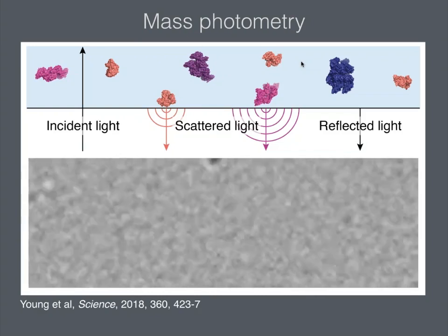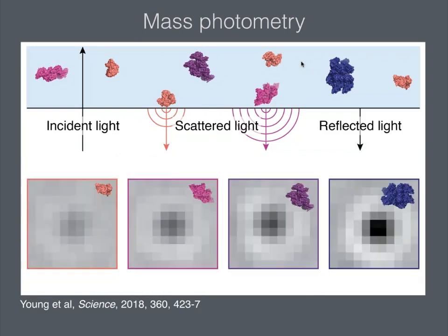So we can look at this video and pick out molecular events, and I can show you 4 characteristic maximum contrast images that we can ascribe to 4 individual oligomeric states: the monomer, the dimer, the trimer, and the tetramer. You can see that those events, those dots, vary in their darkness, right? Clearly the one on the right has much higher contrast than the one on the left. So that gives us the impression that we're not just detecting molecules, but detecting them in a quantitative manner.